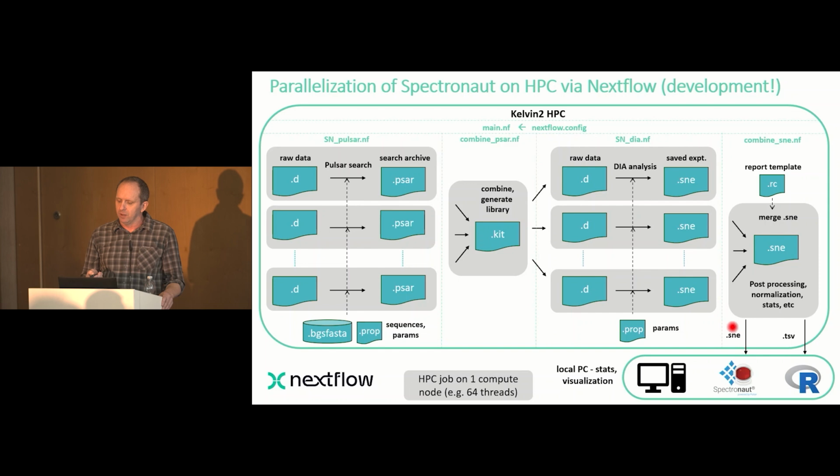And we can then, as usual, take this SNE file and bring it to a local computer to do statistics, or data visualization, or the built-in statistics in Spectronaut, or whatever kind of downstream statistics you are interested in, like in R.